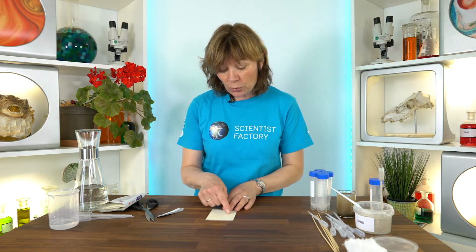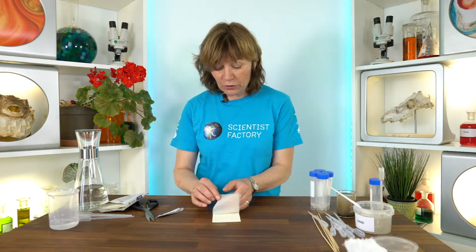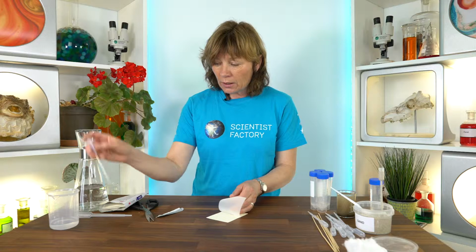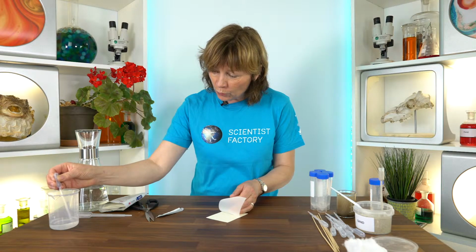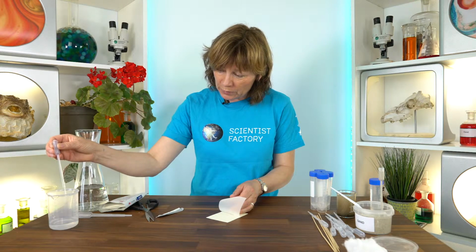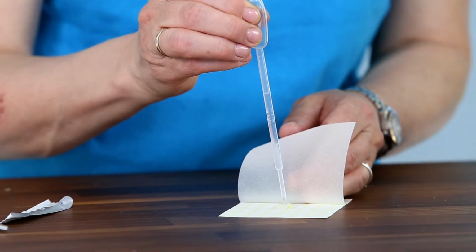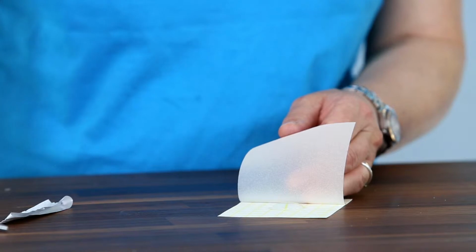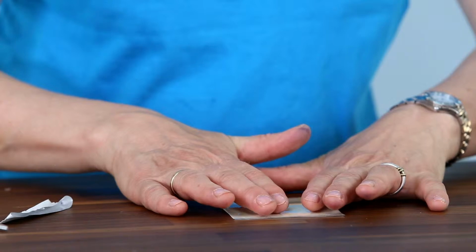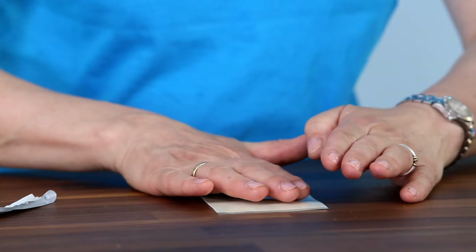We are going to add 1 milliliter of water to each film, and we lift it up like this. We don't touch it now if we have a new film. And we need just 1 milliliter of water. That's like, this is a 1 milliliter pipette. And we add it here in the middle as one big drop. And then we just place the top over and squeeze very carefully, not too hard, because then we will squeeze the water out of the film.